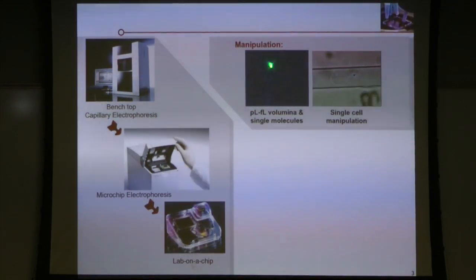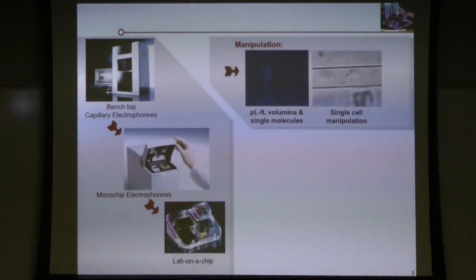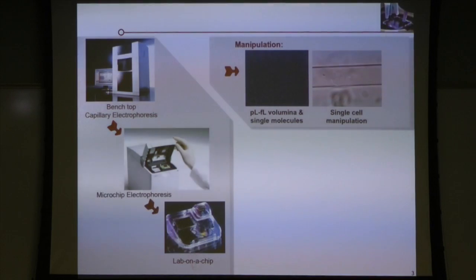This is the light blue part from top to bottom. You've probably seen it. I can start this again. So if we do this in an adequate way, we can inject a single molecule with this method. So I'll show you when it comes. Here it was. Okay. I've seen this so often, so it's so clear to me, but believe me, you can inject. So I don't have a real application, but I just wanted to demonstrate that it's really possible to manipulate either a very low volume or even single molecules.